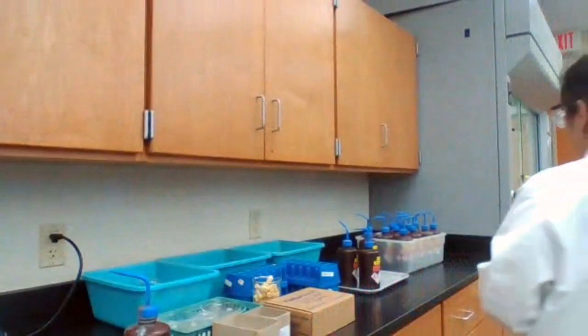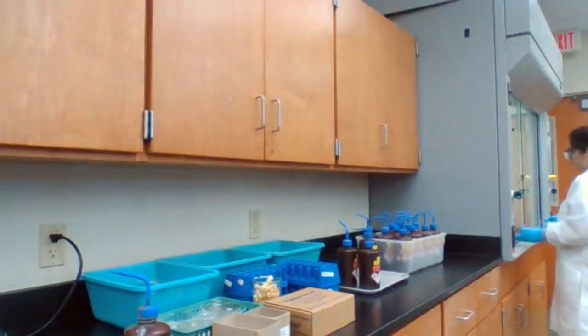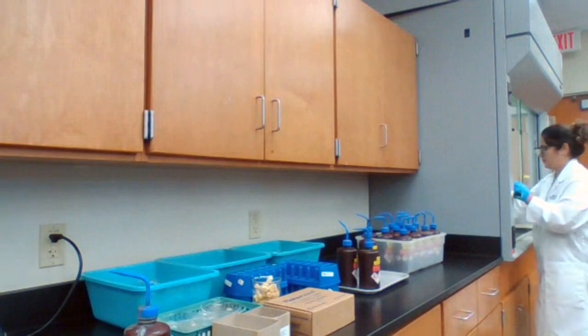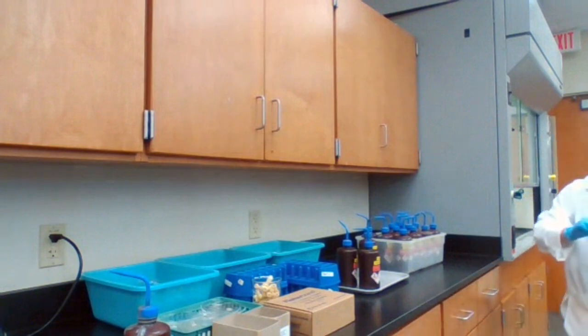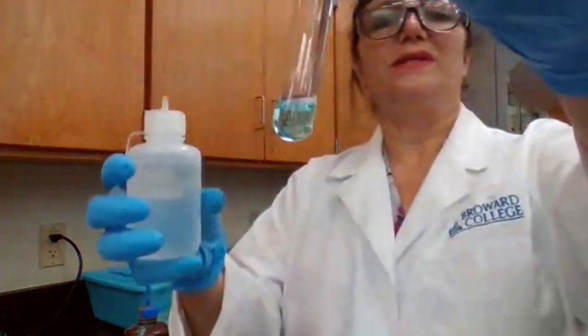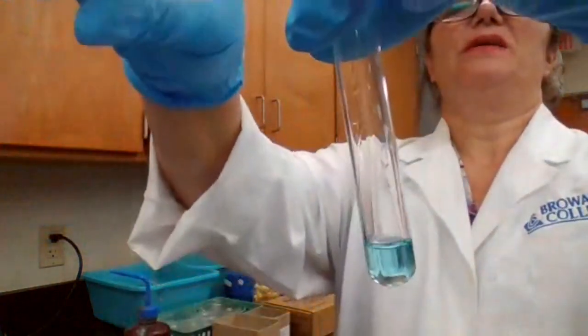Then we are going to add 4 drops of 6 molar HCl. We add 6 molar HCl. Please pay attention to what is happening as I'm adding the HCl.